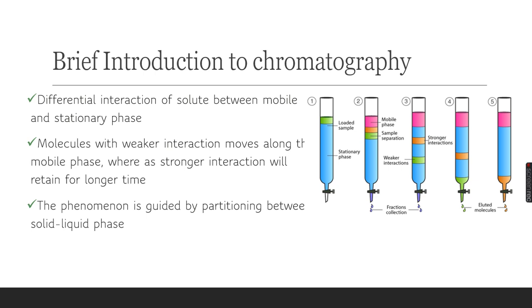It is very similar to the adsorption process, of course in a localized manner, but there are some differences also. We don't assume the adsorption comes to equilibrium. Every moment it is going on, so it is not an equilibrium condition but rather a transient state, because your solvent is being renewed every time as the mobile phase is constantly fed into the system.